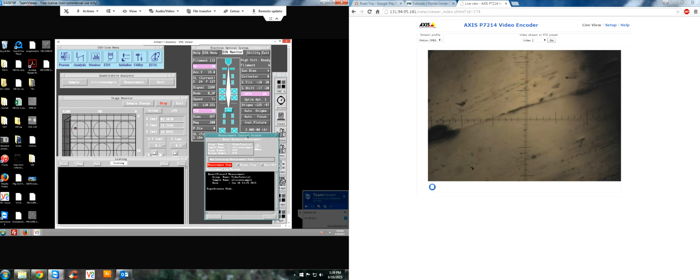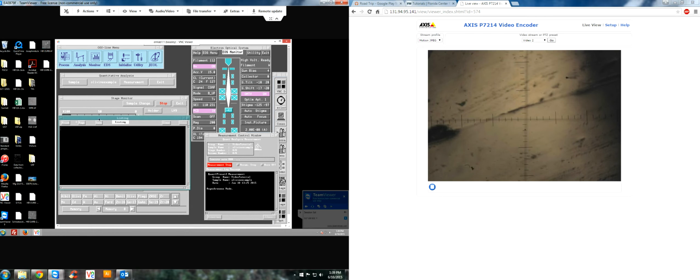And I feel confident because it's optically in focus, and it'll be analyzing now, and then we can see the real-time data over here under this window where it says listing, and it's going to list all the information you need: channel element, the accumulation counts per second, where the peak is located, and then its weight percent calculation. Okay, and so then what I like to do is, as soon as we're analyzing that first point, I like to go to standard analysis, and I'll show you why in a second.